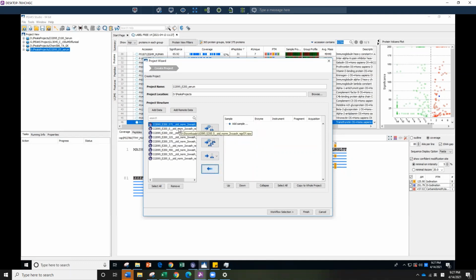But if you use the first button, that is going to combine them into one analysis, so it will become one sample. Most of the time you're going to do it into different flasks, so each sample will have its own de novo files. That is a lot easier for you to have more detail for your sample runs. If you want to group them, you're welcome. You can group them for quantification at the quantification step really easily.